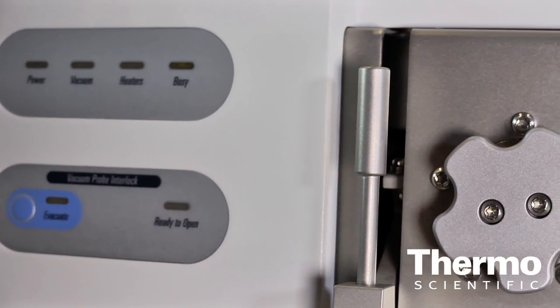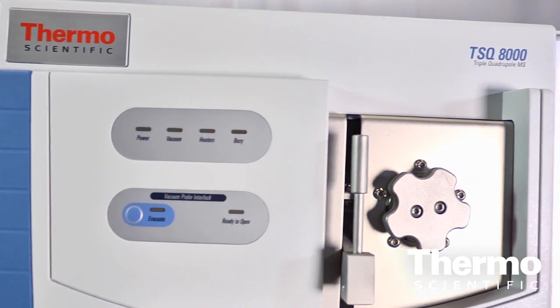The TSQ-8000 is our brand new GC triple quadrupole. It features a very robust design — the number one design goal of the instrument was to create a very robust source.